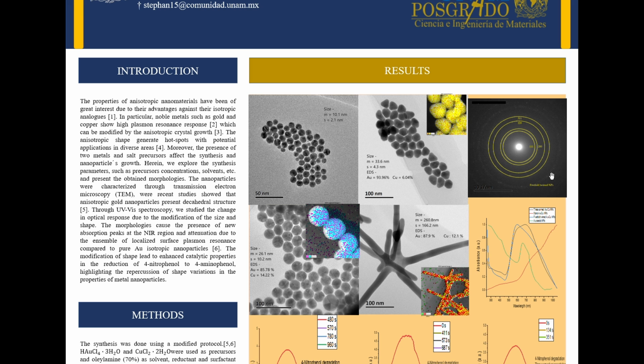In this electron diffraction pattern, we indexed the 5-fold twin nanoparticles, and we see that we have the planes that express the face-centered cubic atomic array. By this, we confirm that the twin nanoparticles express the 1-1-1 facet.